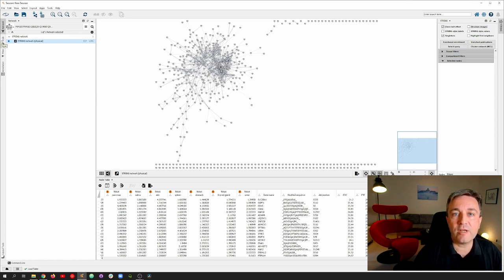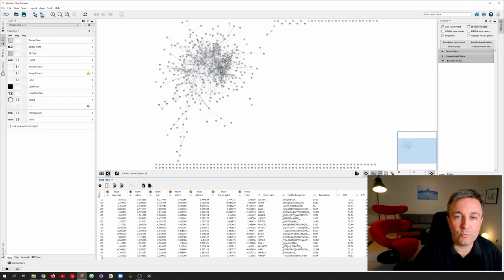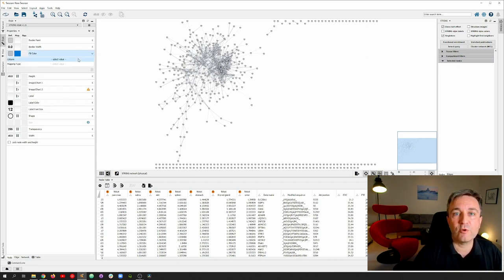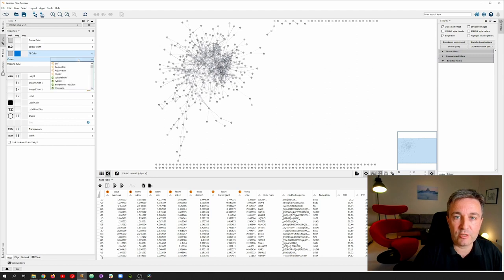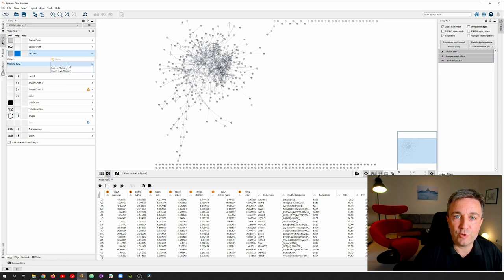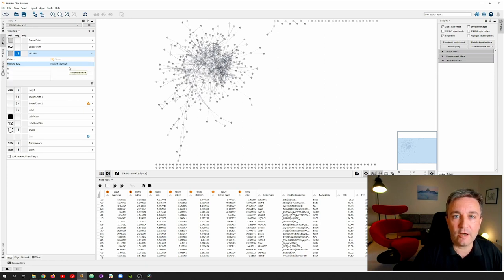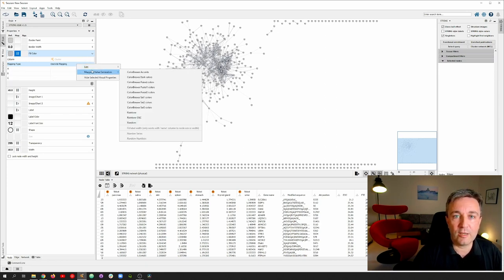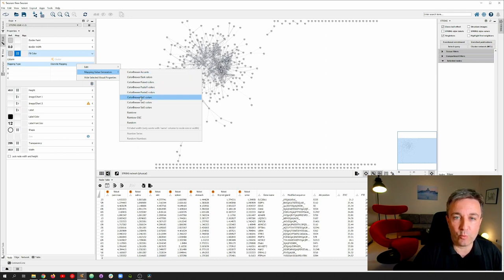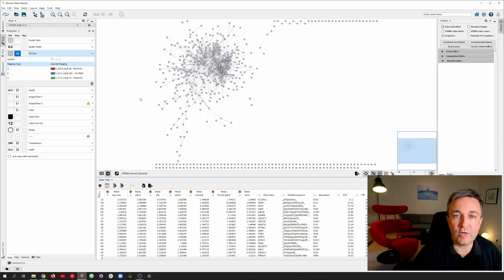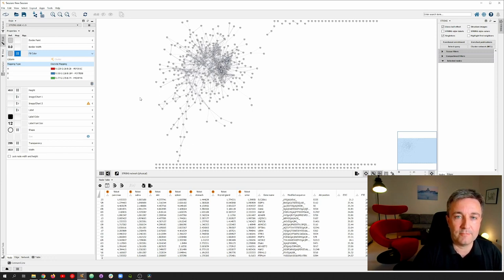Once the data are imported, we go to the visual styles panel, select the fill color, and say that we want the fill color to depend on the cluster assignment. Since it's ABC, we choose discrete color scheme and use the color generator to create a color palette from color brewer, set one. Now you have the notes colored red, green, and blue, depending on the behavior in the omics data.